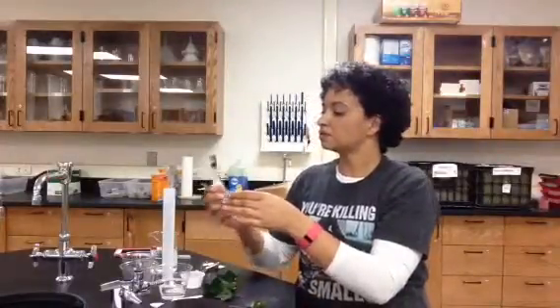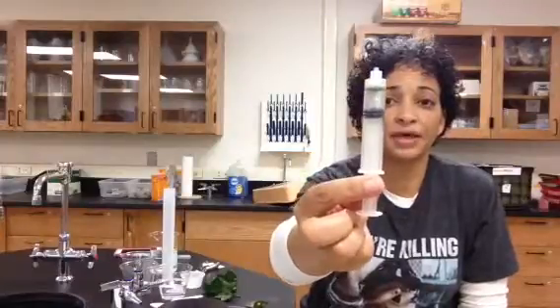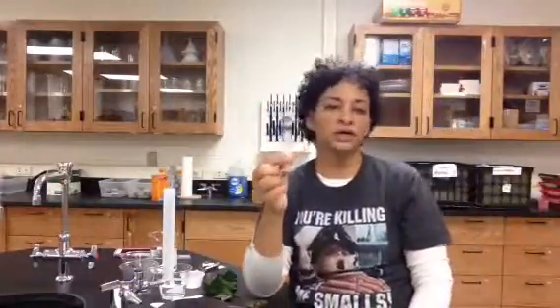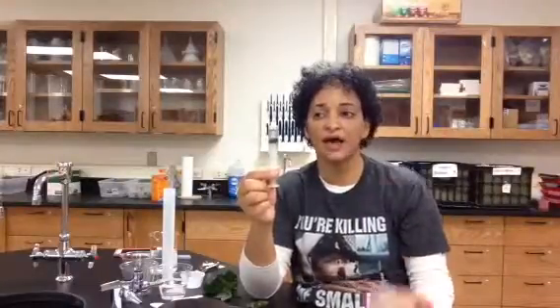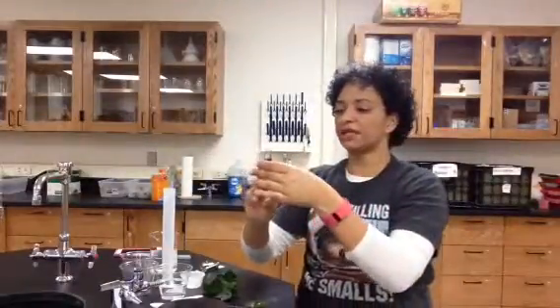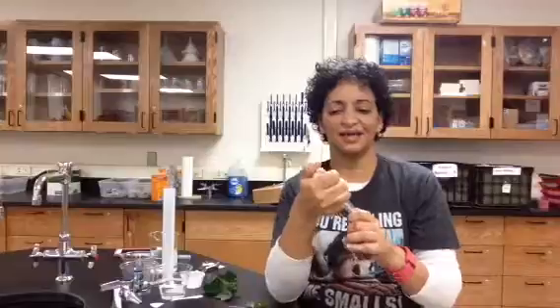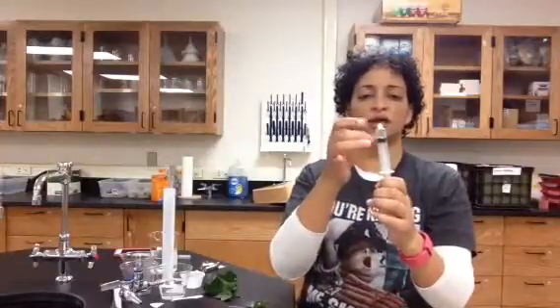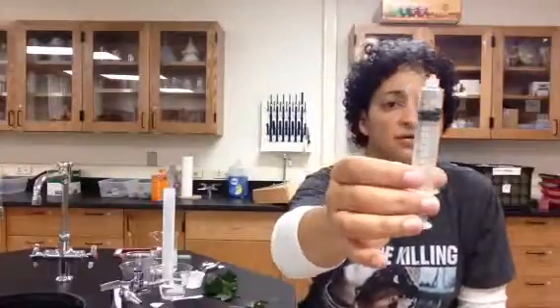All right, so if I look now, you can see my leaf chads are floating at the top of my syringe. What we're going to do is we're going to create a vacuum in the syringe. We're going to suck the air out of those air spaces, and that will cause my leaf chads to sink. So first thing I need to do is go ahead and squirt out any excess air I have in here. Okay, now I'm going to put my thumb over the tip of it, and I'm going to pull back just a little bit, and then let go. And that should cause my leaf chads to sink. There we go. So see, now they're all at the bottom.